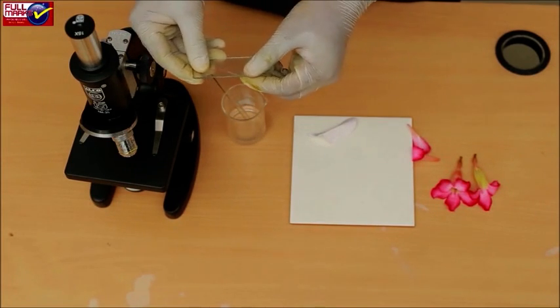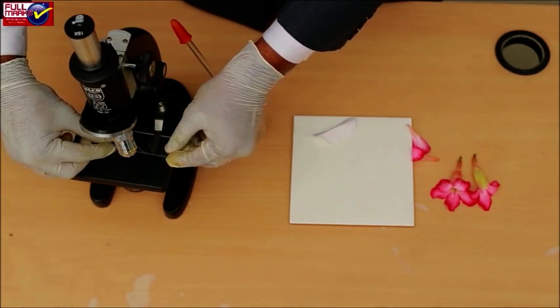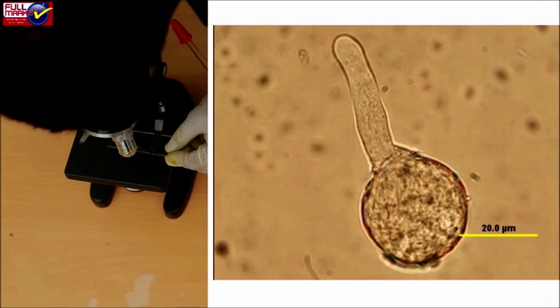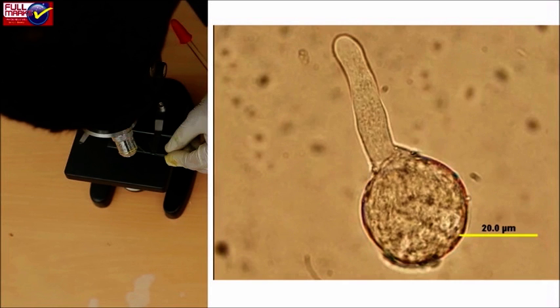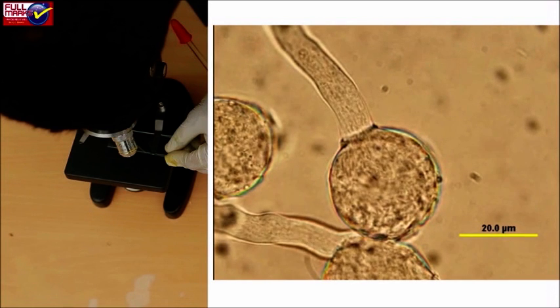Observations: Many pollen grains are present over the stigma. Pollen grains absorb water and other substances such as sugar and organic acid secreted by stigma. Observe many pollen grains germinating over the stigma.